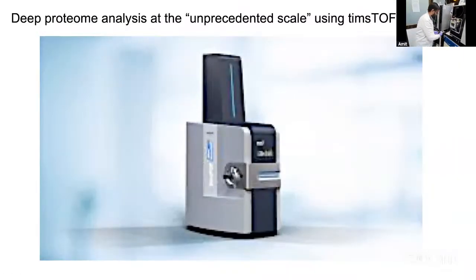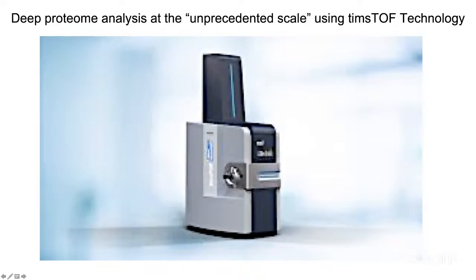So I think, student participants who are available online, what different types of theory you have studied already, now you can see their actual practical aspect, along with the instrument demonstration. Now what we are going to do is show you a new technology, which is one of the latest in the field, the timsTOF technology, which does 4D proteomics analysis.